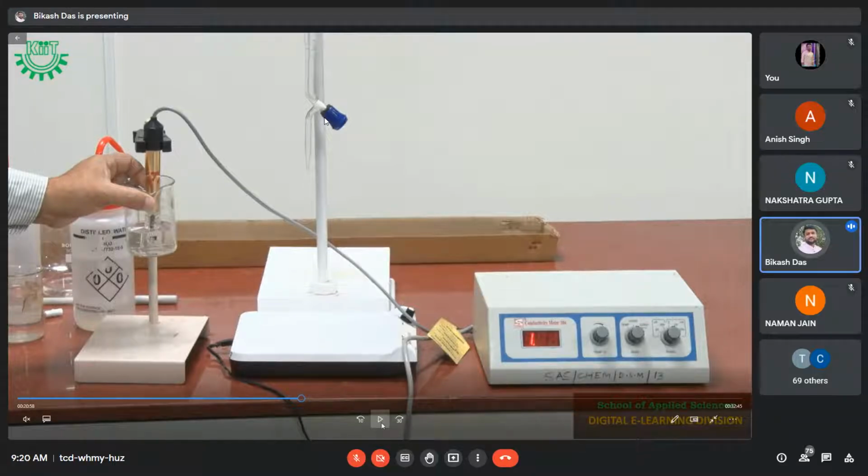At the very beginning, I already gave you the information that in pure acidic medium the conductance will be the maximum, because the conductance is due to only free H plus ion and Cl minus ion. So in acidic medium, the two ions are sufficient, so conductance will be the maximum. But when sir dipped the electrode into that HCl solution, what is the reading showing in the display? How much is it showing? 1.0. Can anyone give me some idea why it is showing 1 point?